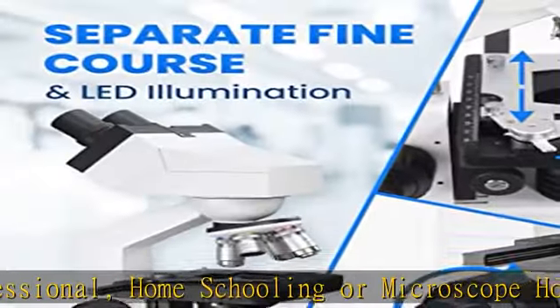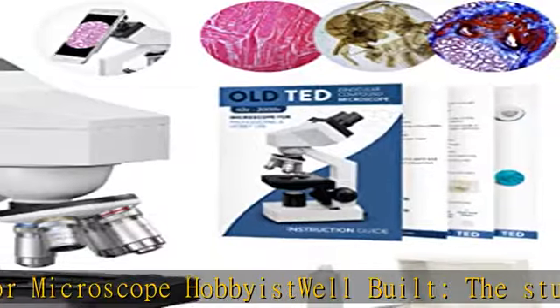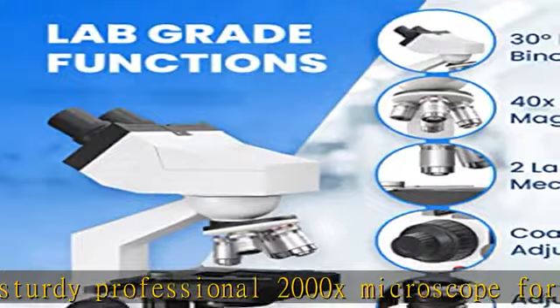Suitable for lab and clinician work. The mechanical stage allows high quality examination of specimen samples via accurate x-y controls for specimen movement at high magnifications.